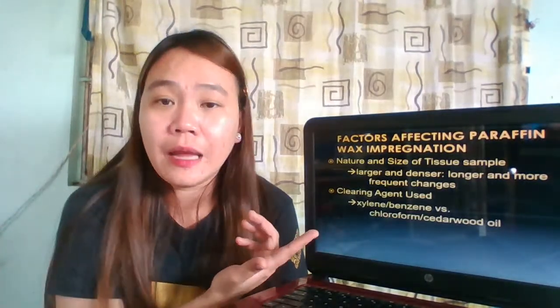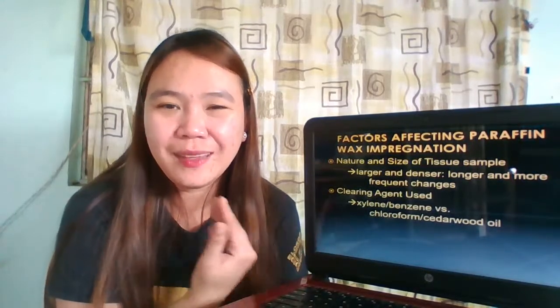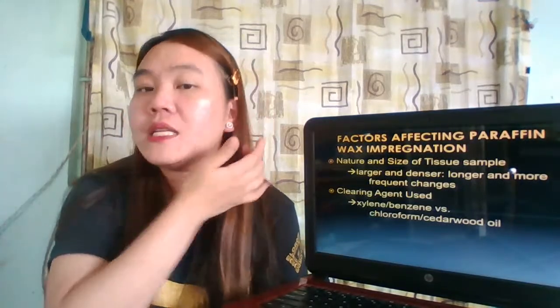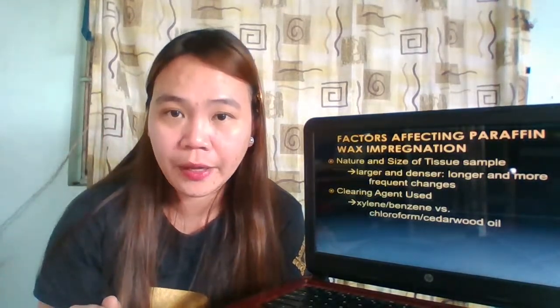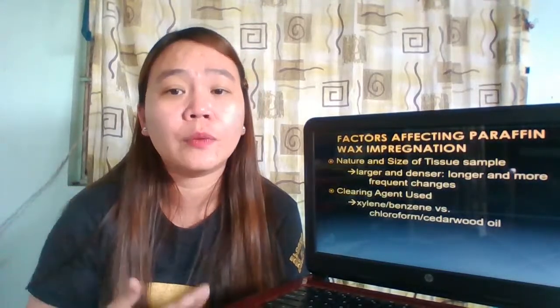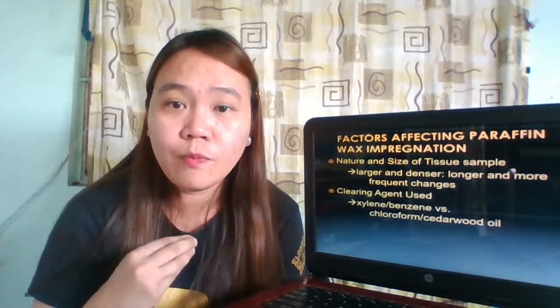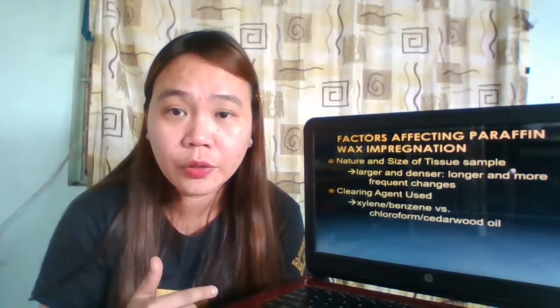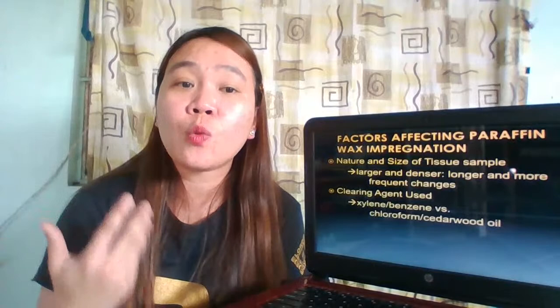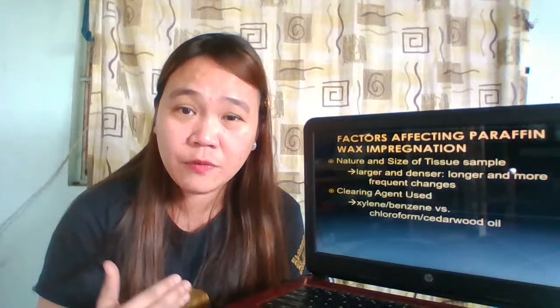Another would be the clearing agent that is used. Remember when I discussed clearing a while back, I mentioned that the clearing agent that you use will affect the infiltration process. So say for example, if we compare xylene or benzene versus the use of chloroform or cedarwood oil, which one will have a faster impregnation or infiltration process?